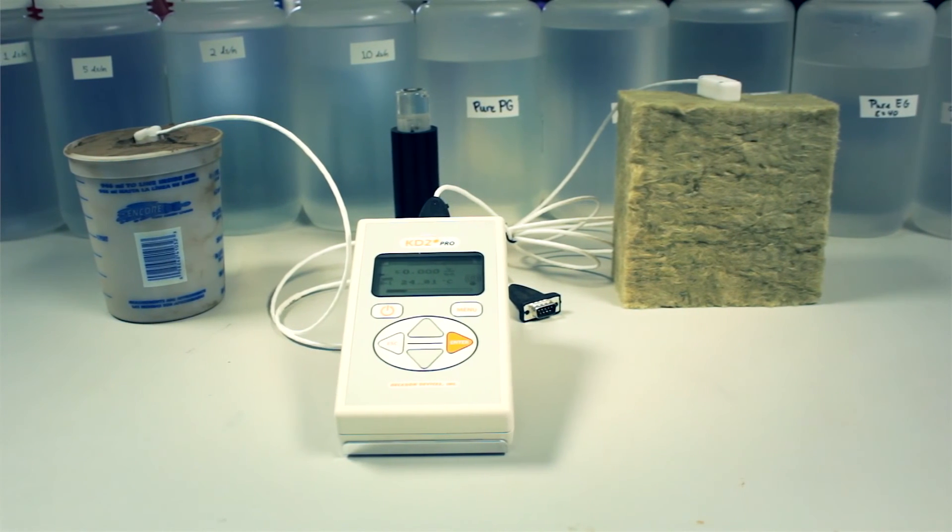So what do you need to measure? Whether you work in the lab or the field, we invite you to learn more about the KD2 Pro. Give us a call or visit Decagon.com.